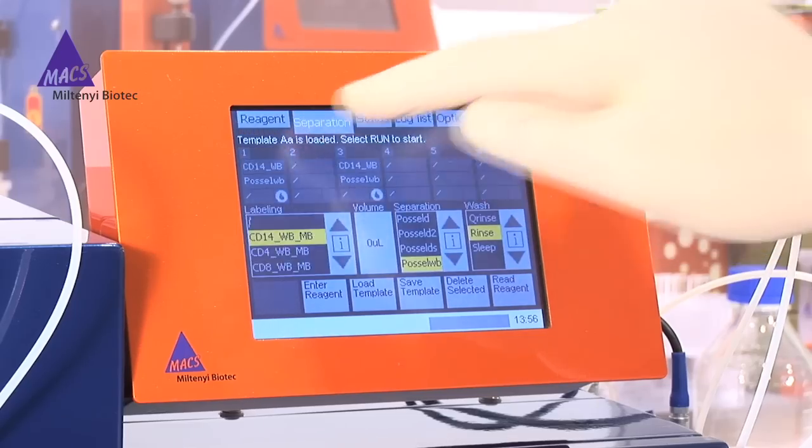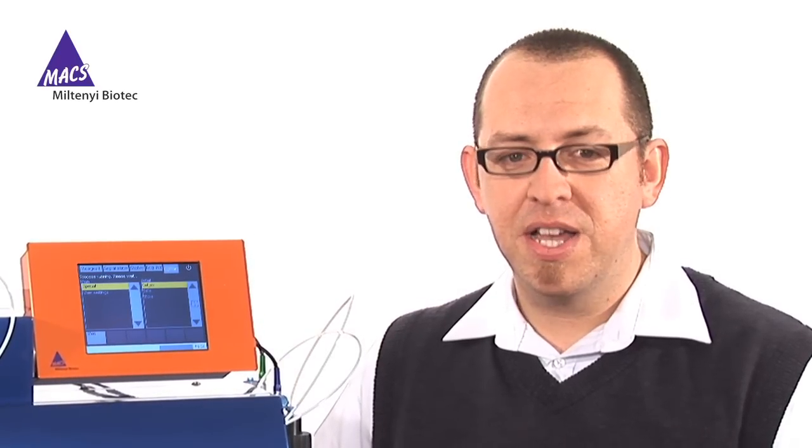That's it. From whole blood to purified cells in 30 minutes. Fast, efficient, and reliable. To learn more about the many options of the AutoMACS Pro Separator, log on to AutoMACSPro.com.